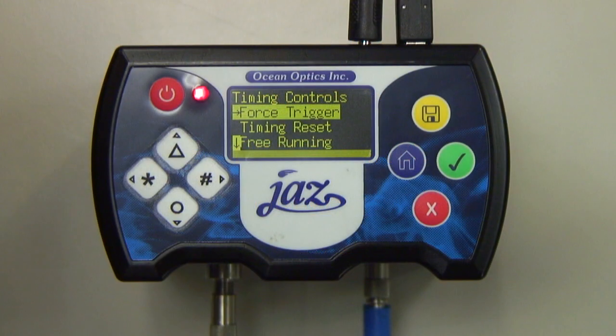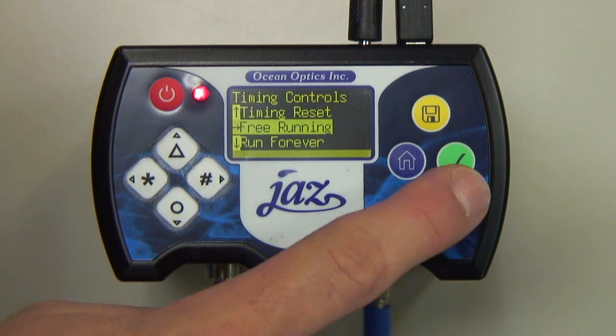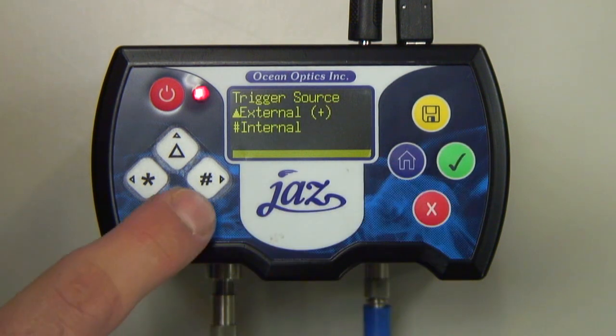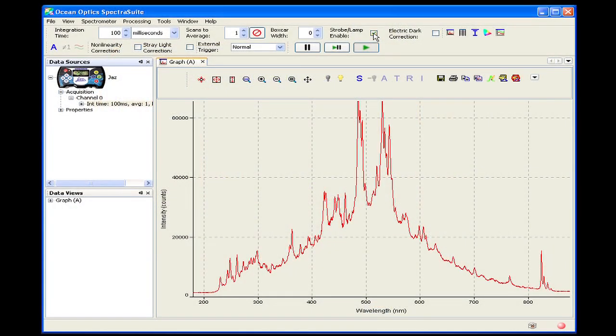In this video, we'll show you how to properly operate the PX in free running and triggered modes. We'll also operate the PX directly through the Jazz DPU and then through Spectra Suite software by Ocean Optics.